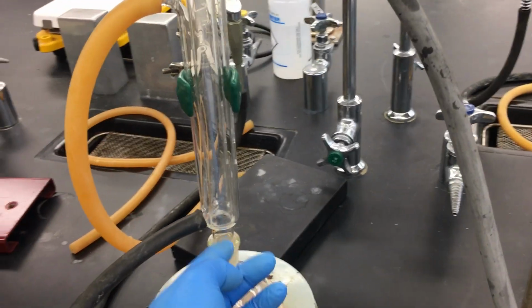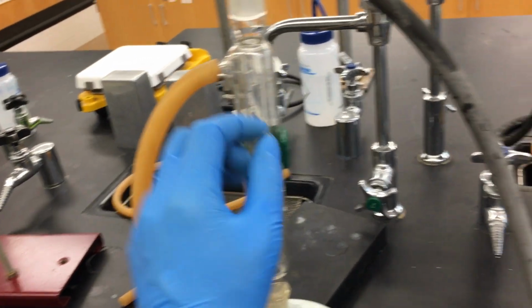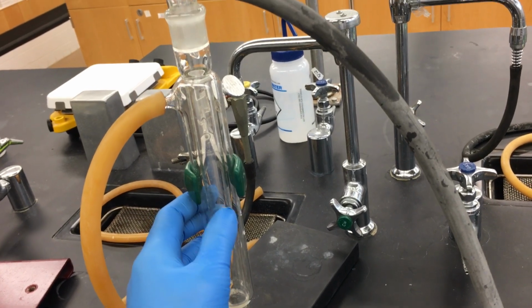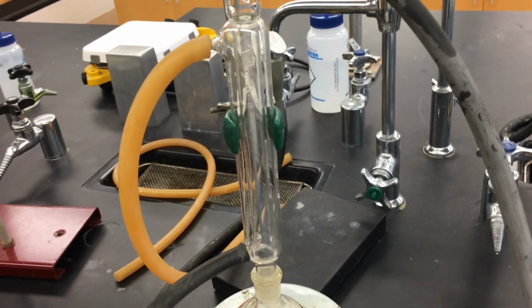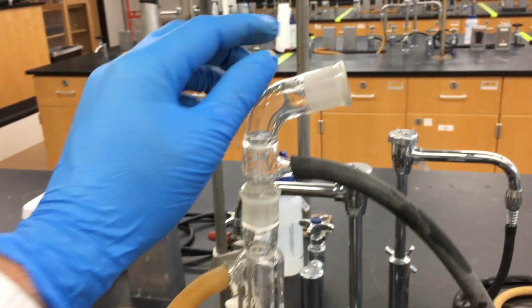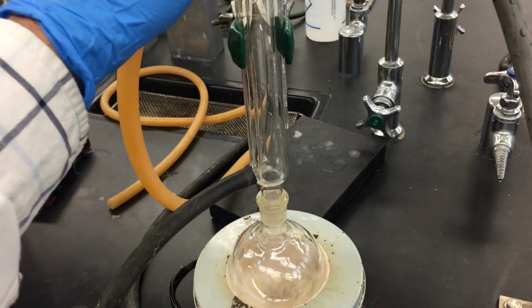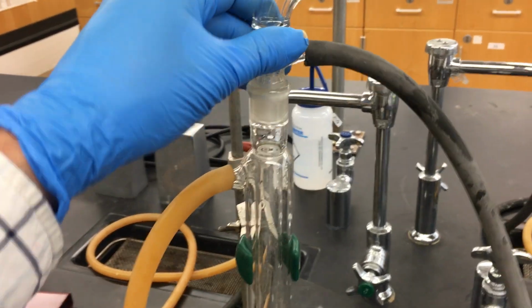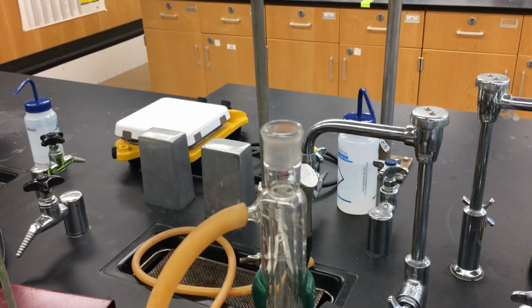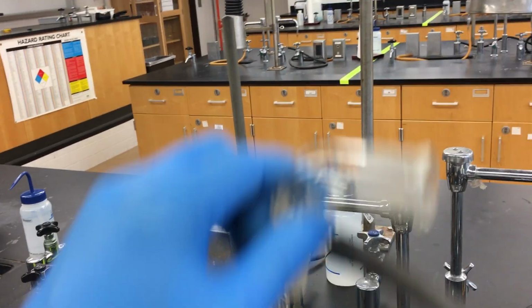Now, as the reaction boils, the vapors from our solvent will rise up, and we want to control the heating in such a way that the line on the condenser is somewhere in the middle but not too high. That's optimal for the reaction. Regardless, we have connected one more glassware here, the vacuum adapter, because we are going to make sure that any hydrobromic acid fumes that are generated in this reaction do not just escape through the condenser into the hood, where it can damage the hood. We will lower the hood later on before we start the reaction, so that all the vapors are actually removed from this room rather than ending up in our lungs.